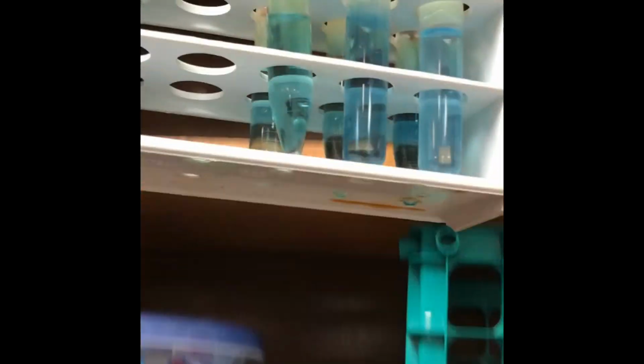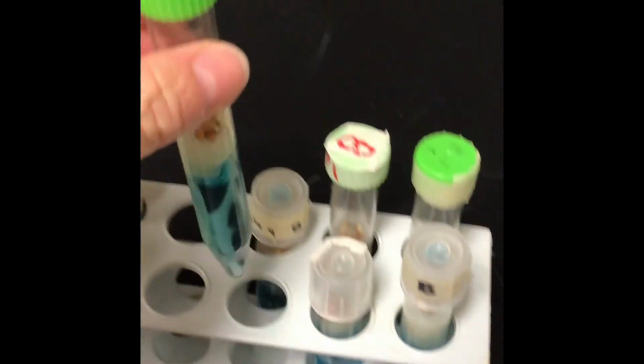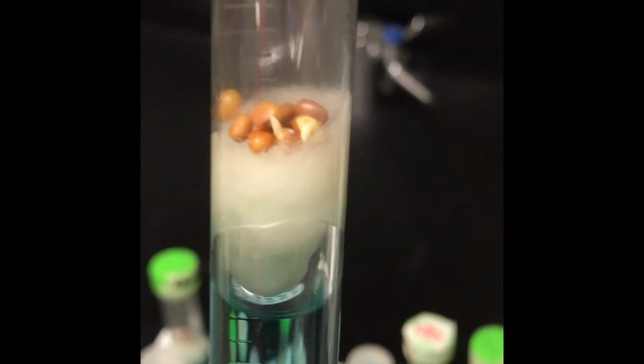Okay, now we're ready for tube B to analyze. See how you guys did after 1 day. So here's your tube. Whoa, check that out. Okay, so let me see if I can get it better for you. There's the color. And then let's see if I can give you a top view of the seeds.